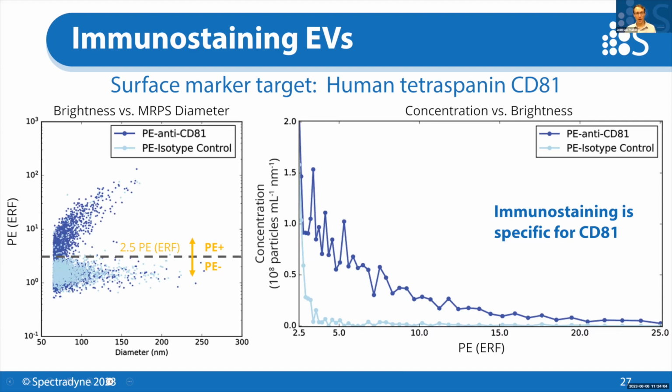And we know from other of our collaborators' research that's to come that the brightness here is proportional to the surface area of the particles. So if you plot this versus surface area, it shows up linearly, which is expected, right? Because these markers are on the surface of the particles.